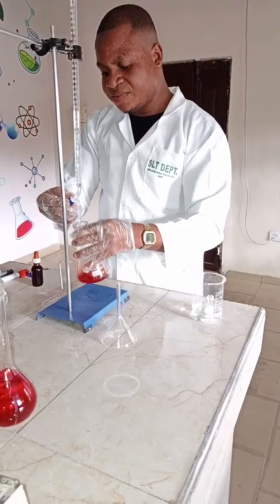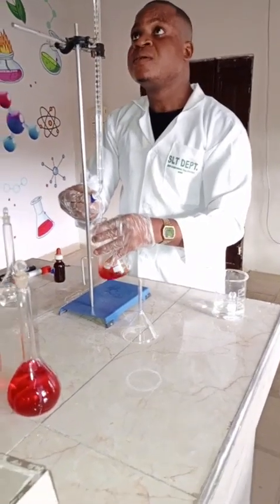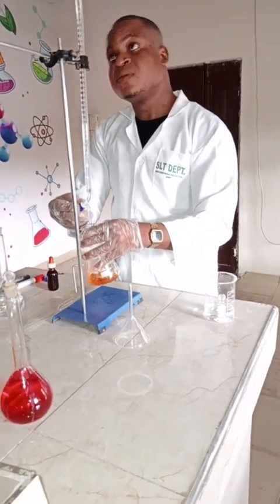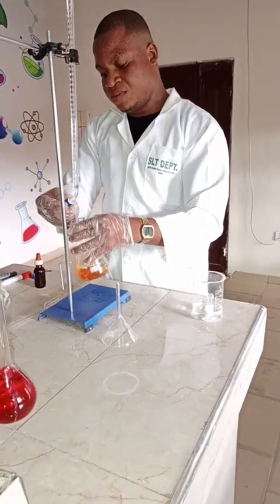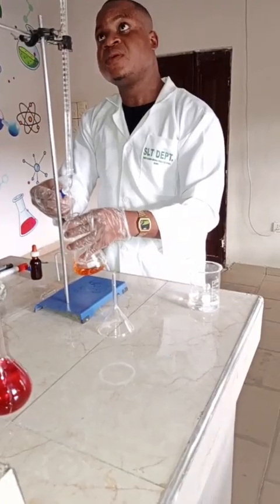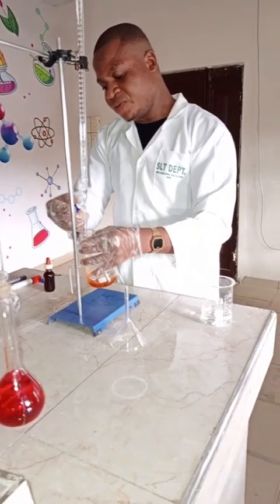Do it gradually. Be noticing that it is changing gradually. Add drop by drop.